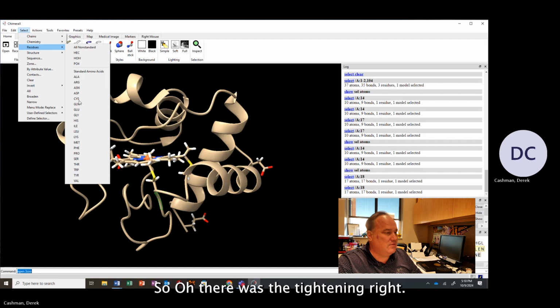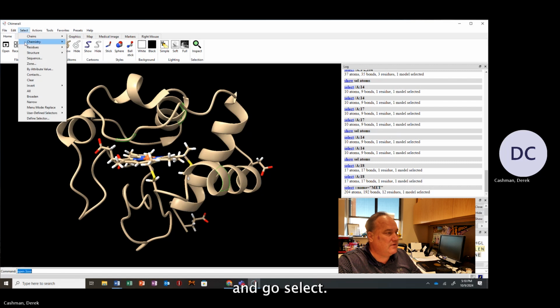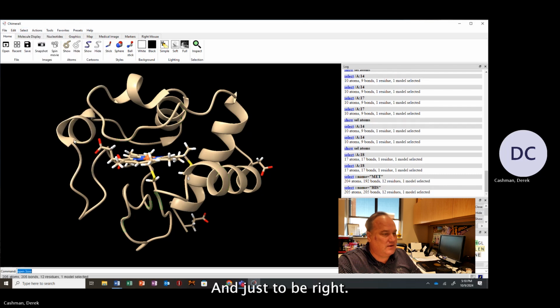Oh, there was a methionine, right? It was a histidine and a methionine. Now, if I want to select, I've just selected all the methionines, so there's M, M, and M. There's 3 of them. Now, hold down Control and Shift and go Select. Now select histidine, right?